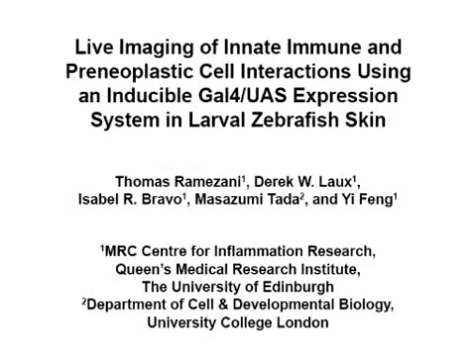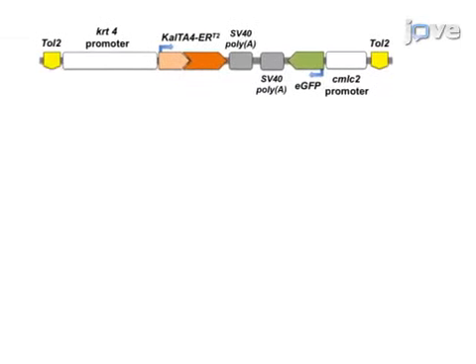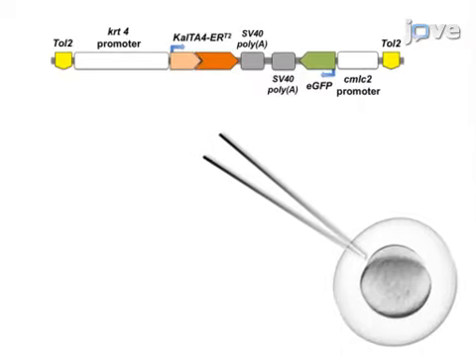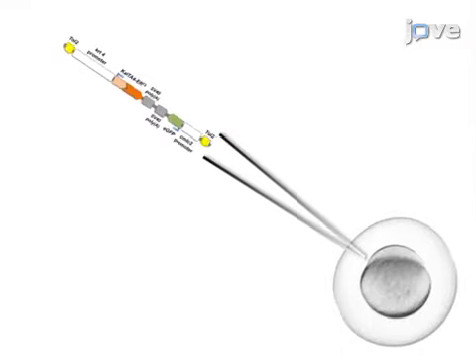The goal of the following experiment is to conditionally induce epithelial cell transformation using an inducible expression system in zebrafish larvae. This is achieved by injecting the gene construct into a double transgenic zygote in the single-cell stage to induce expression in the superficial skin cell layer.